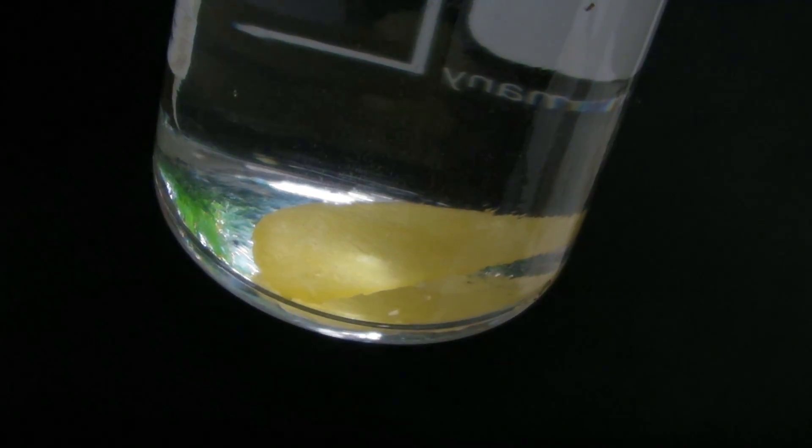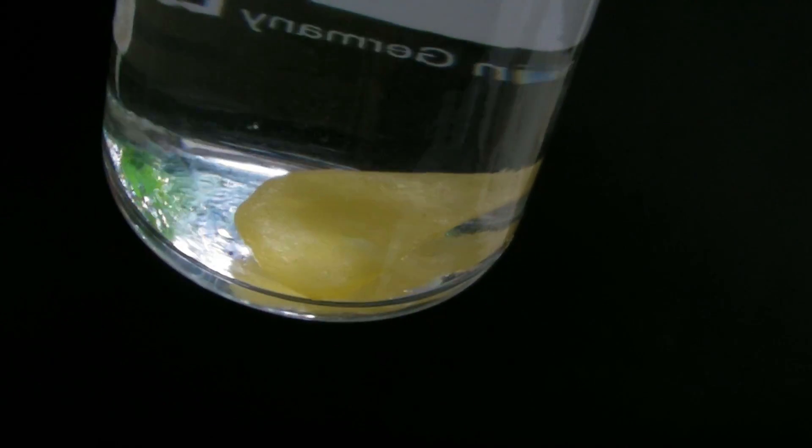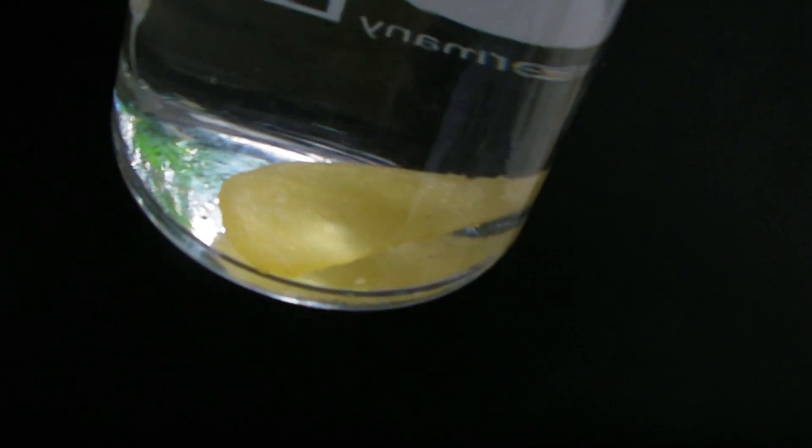The white phosphorus is the most reactive modification of all and has to be stored under water. It is often yellow due to small impurities so it's sometimes called yellow phosphorus.